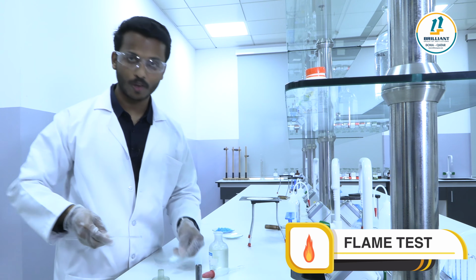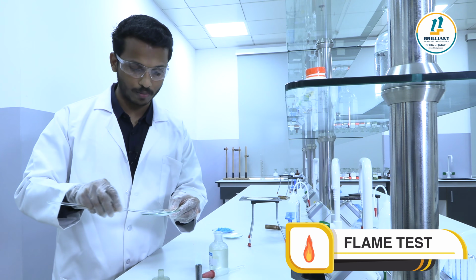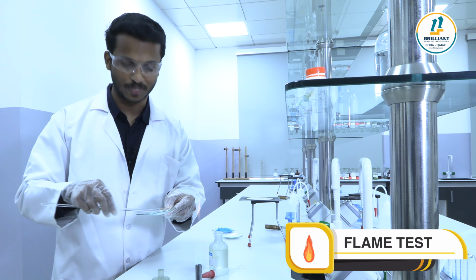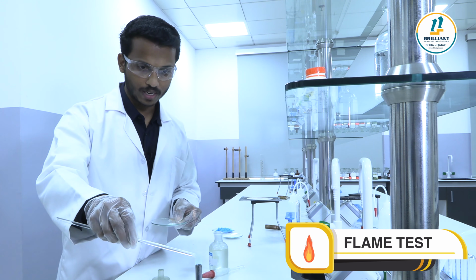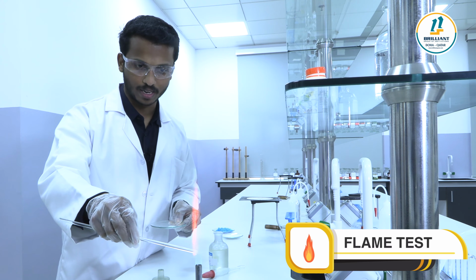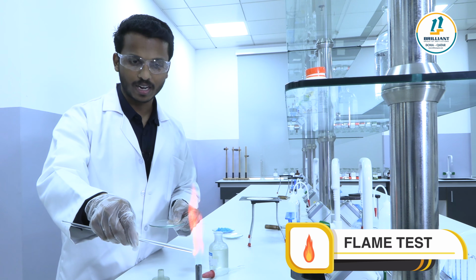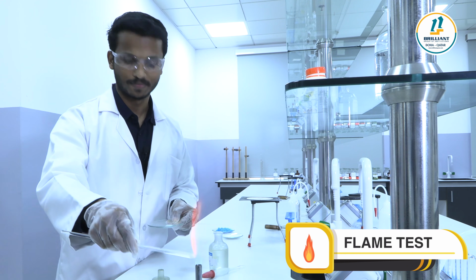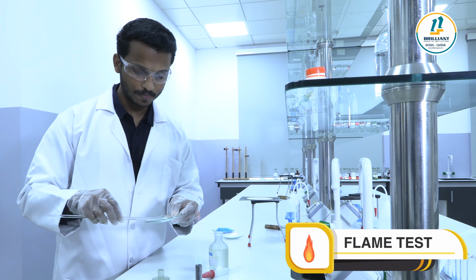Carefully listen, all of you. See the color change of the flame. What is the color you can observe? Very carefully try to observe. You can see that a brick red color is generated. Brick red color, right? This brick red color indicates that it may contain calcium as a cation. Once again, I am showing that.